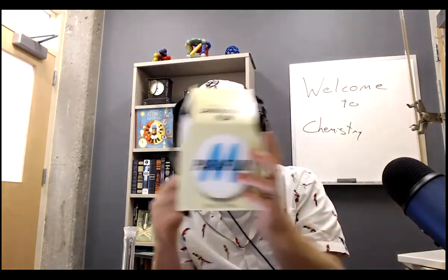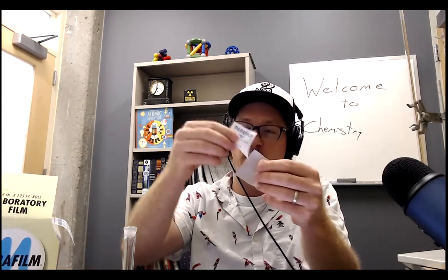We got some parafilm in the lab. This is a really cool material, kind of waxy. It's very hydrophobic. You can use some scissors. You cut off a little bit. It's got some preset lines here. You just need a little square of it. And you take off the paper. The paper's trash. This is the parafilm. It's very stretchy. And then eventually you overstretch it.